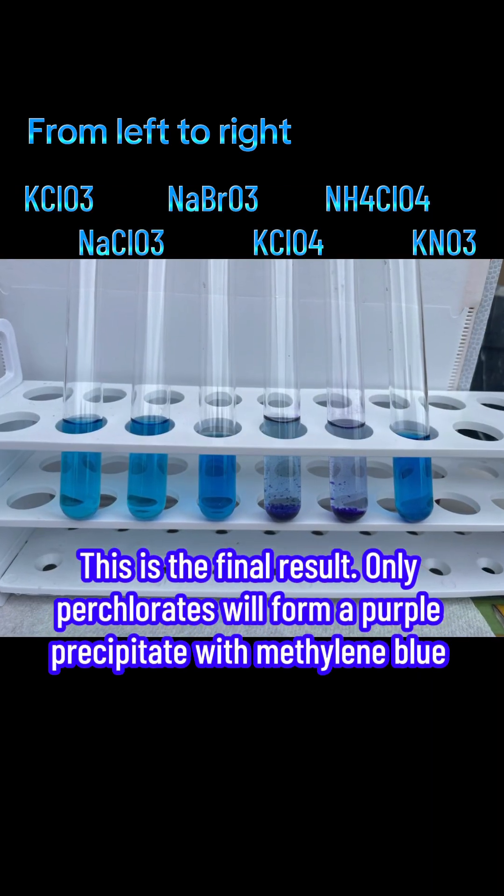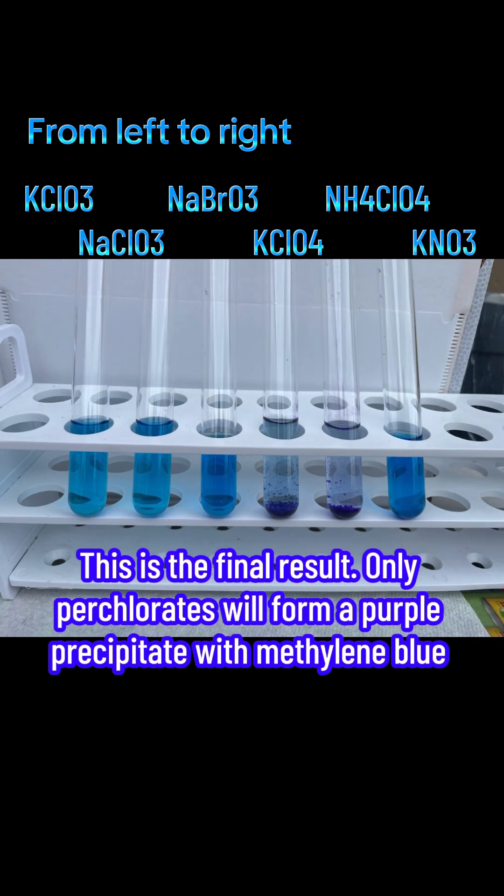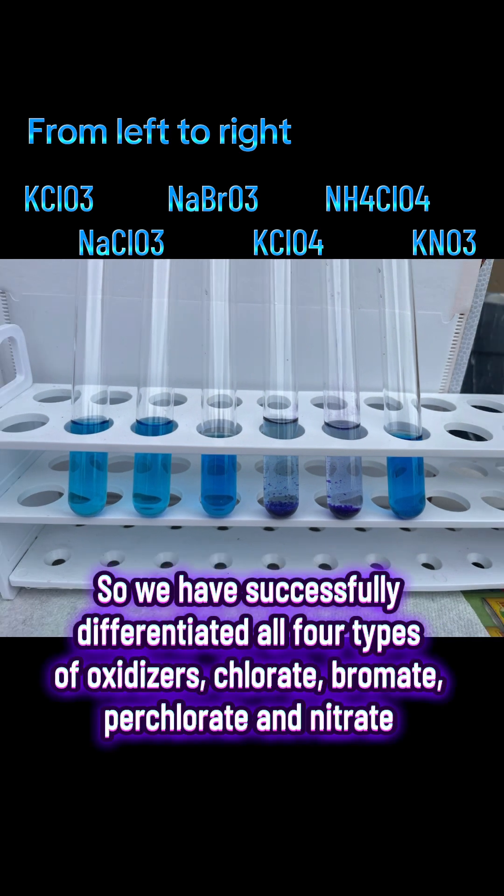This is the final result. Only perchlorates will form a purple precipitate with methylene blue. So we have successfully differentiated all the samples.